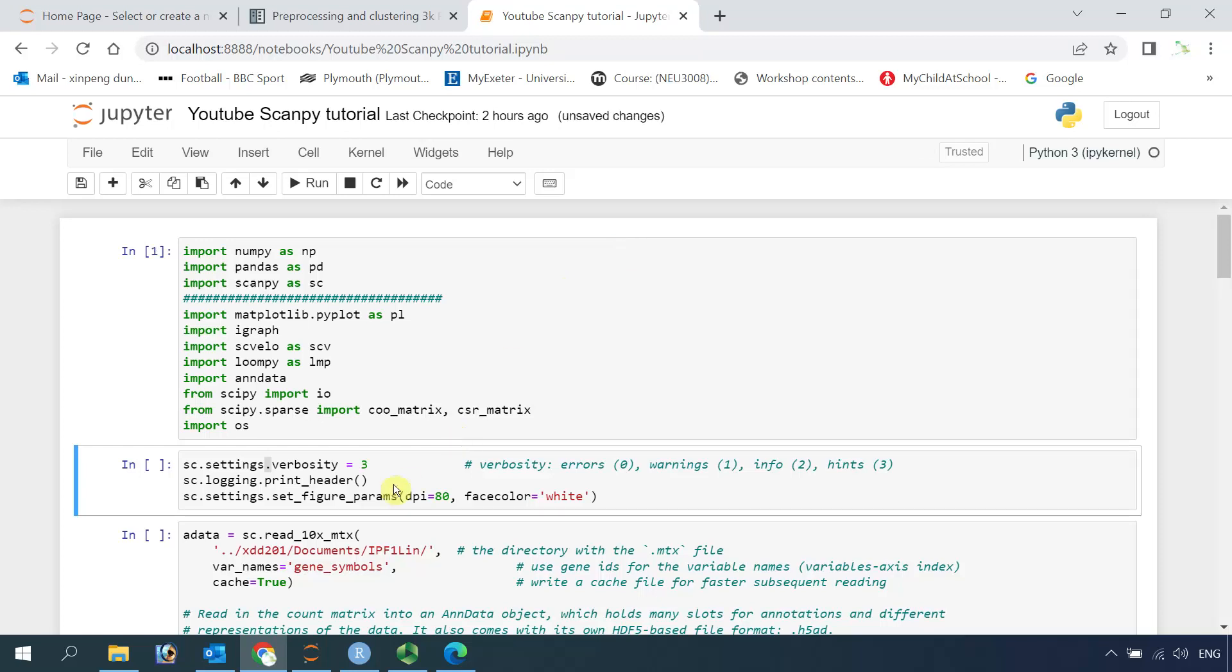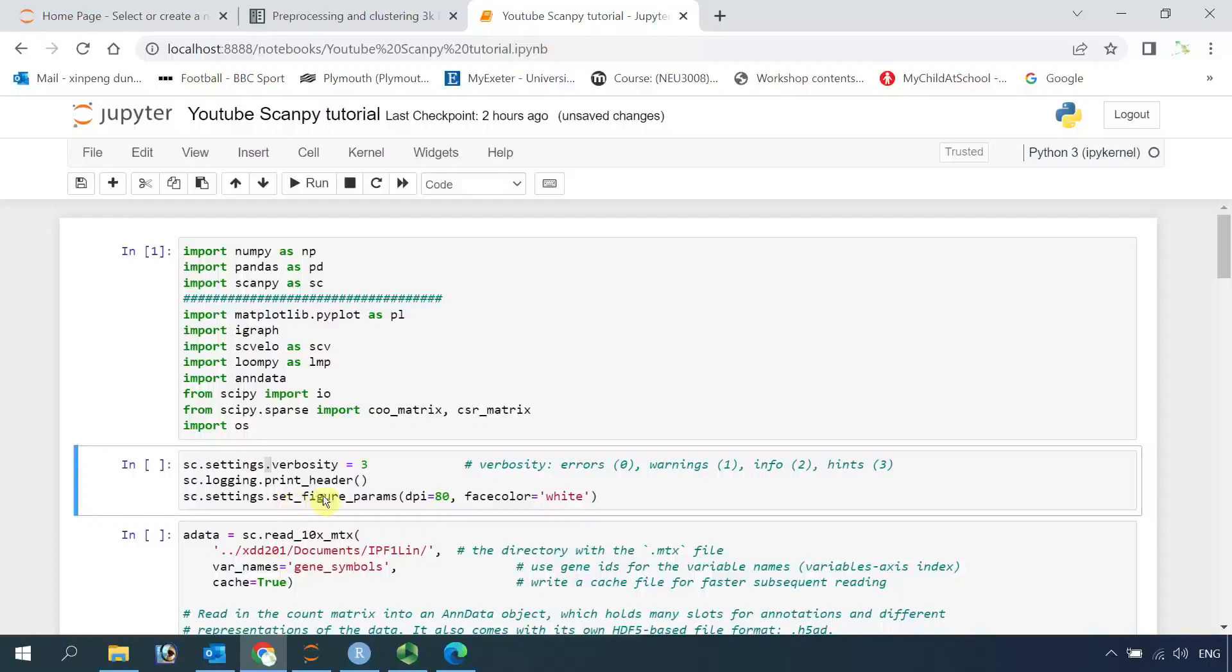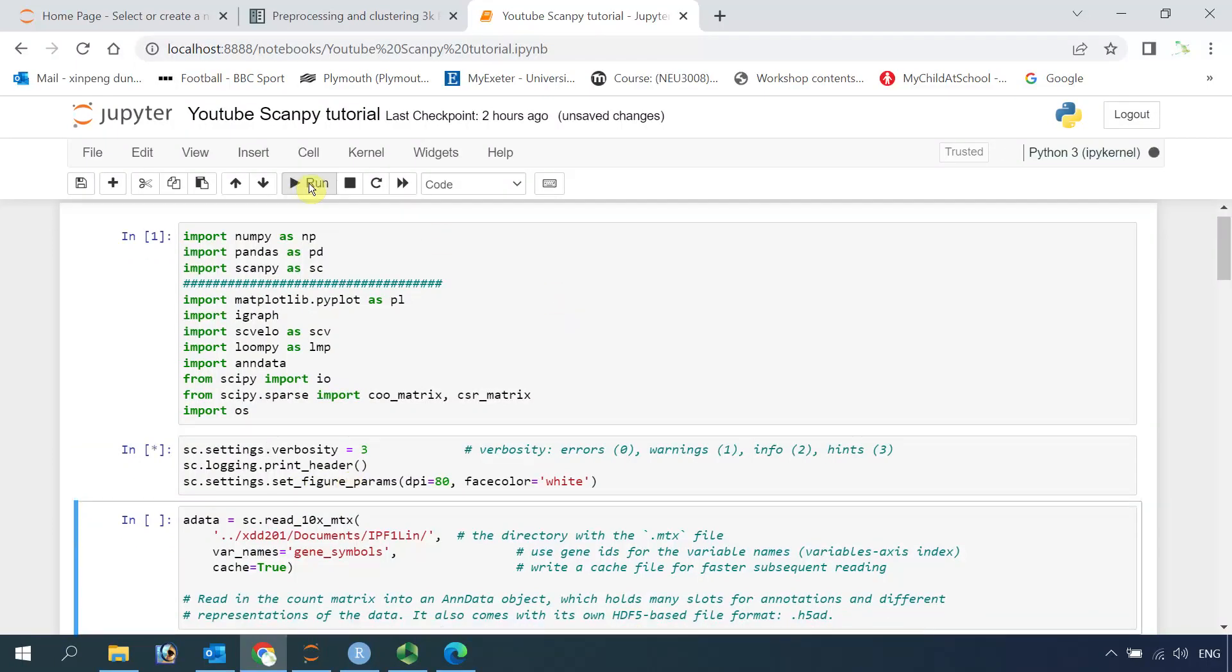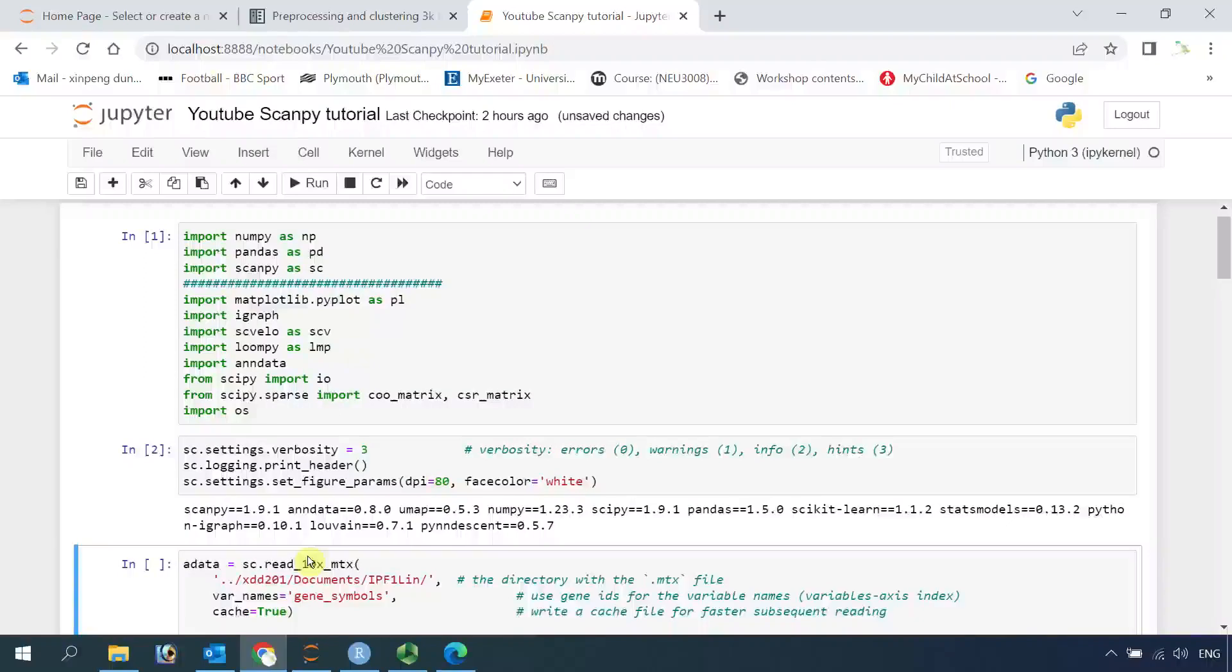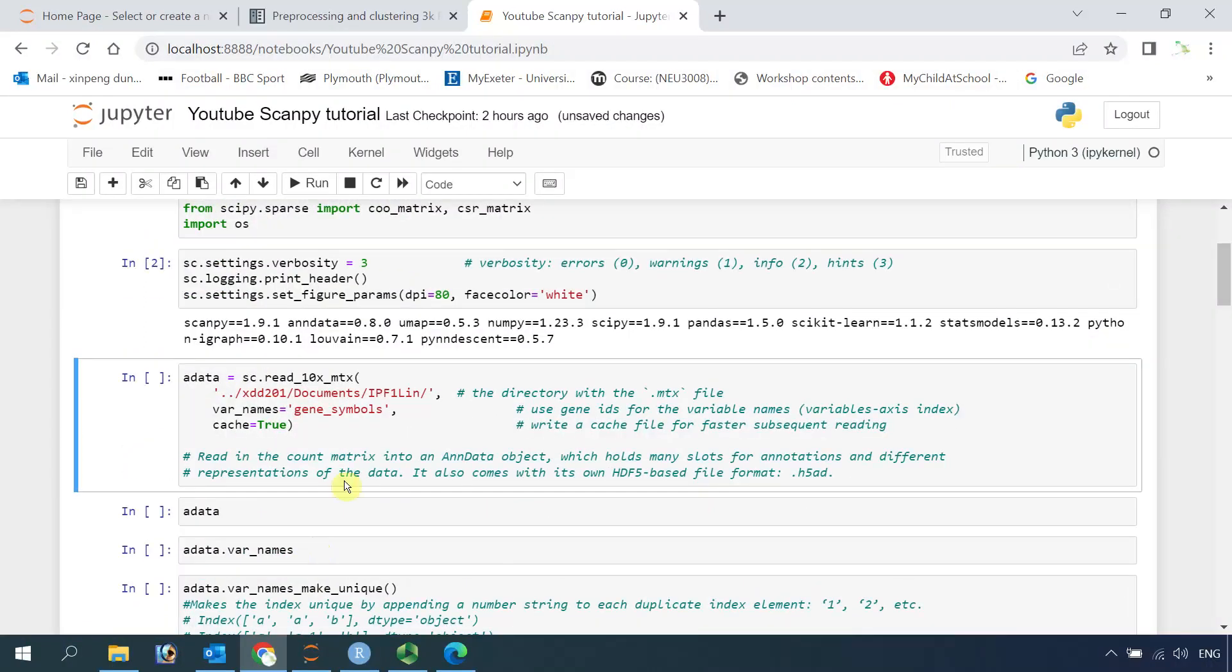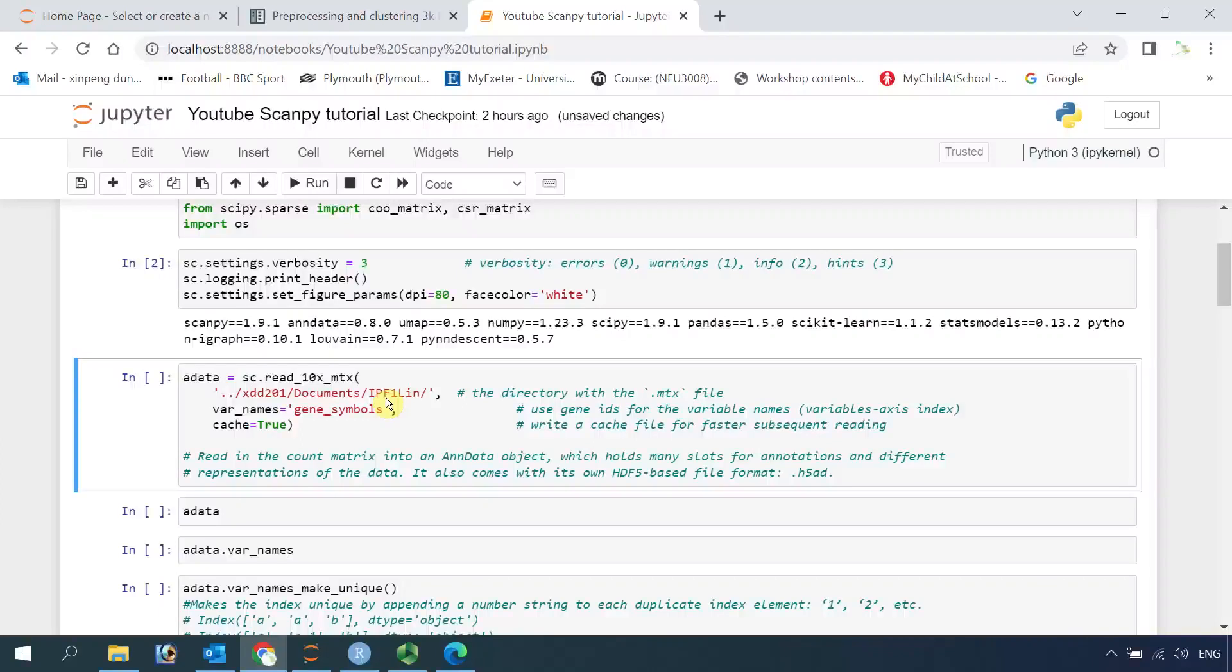Next, we can use the recommended settings for visualized data. I didn't make any changes for those settings. You can just copy it from the PBMC tutorial code. So now we can read the data. You can see here, the PBMC tutorial, they use the HG19. Here, I'm using my IPF1-LIN data for the human fibrotic lung.